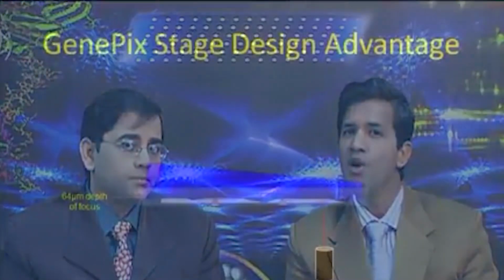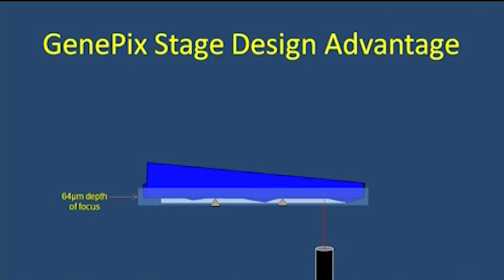So what are some of the advantages of this design of the GenePix stage? Right. So as we discussed, non-confocal coupled with the inverted scanning, how does it help? Usually we see in the glass slides there are a lot of small deformities which our eyes can't see. Right.